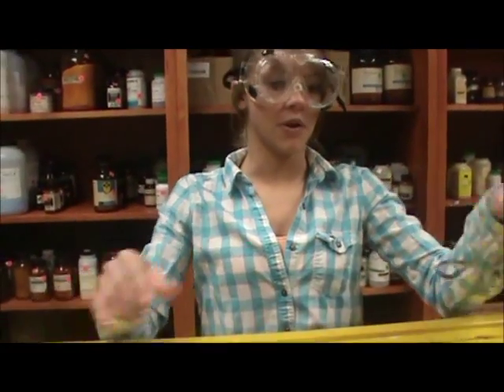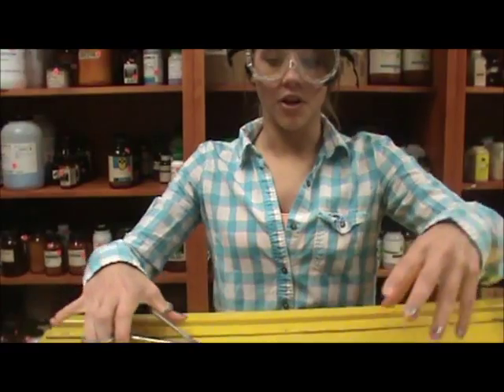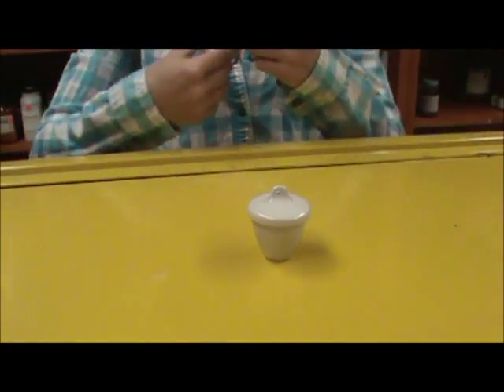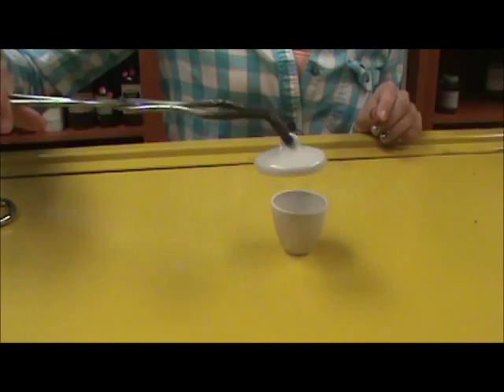Crucible tongs are used to pick up the crucible and cover. To do this, you squeeze around the crucible and simply pick it up. They can also be used to remove the top — to do this, you squeeze the lip and pull it off.